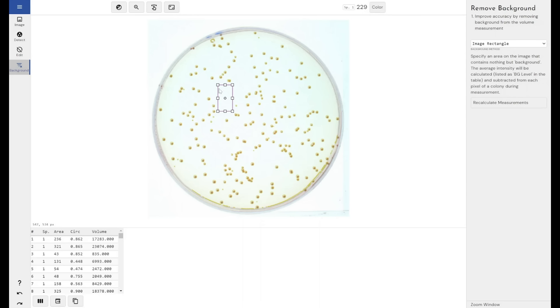The idea here is that the software gives you a rectangle and you define where and the size of that rectangle and the software will average the pixel value for every pixel within this rectangle and it will come out with a number, a pixel intensity. The software will then say, this is the average background and subtract it from every colony within your image.